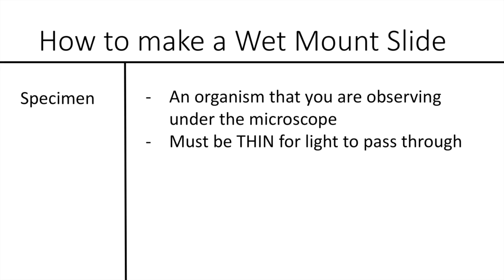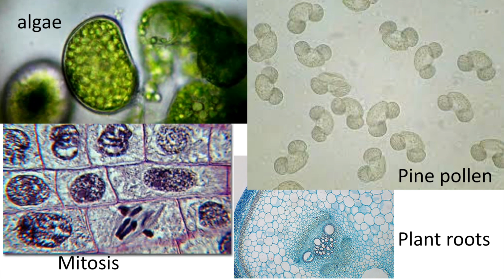Let's go ahead and begin our T-notes. A specimen is an organism that you are observing under the microscope. The specimen must be thin for light to pass through. Here are some examples of some specimens that are being viewed underneath the microscope.